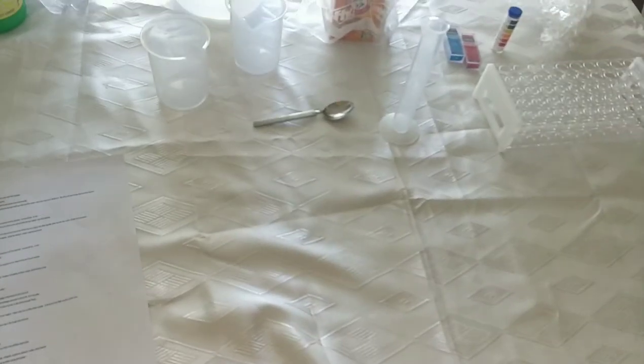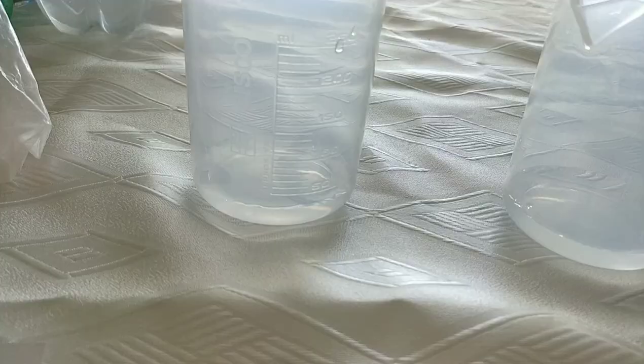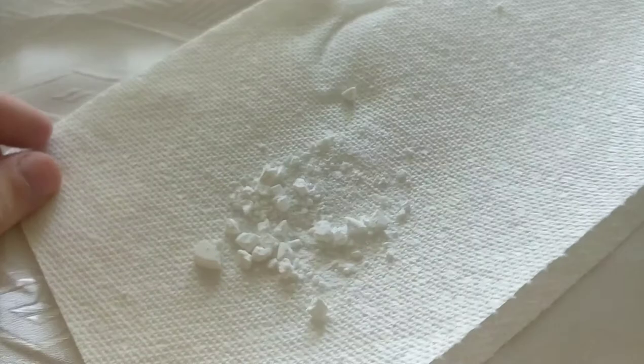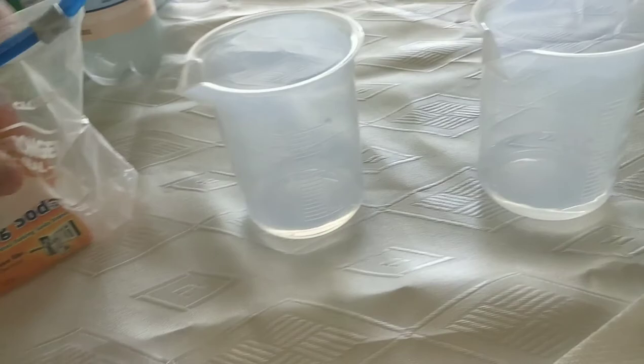We're performing the pH and indicators lab and we'll start by making the antacid and baking soda solutions. I've measured out 25 milliliters of deionized water using the graduated cylinder. I've crushed the antacid and I'll put that in one and I'll saturate the other with baking soda.